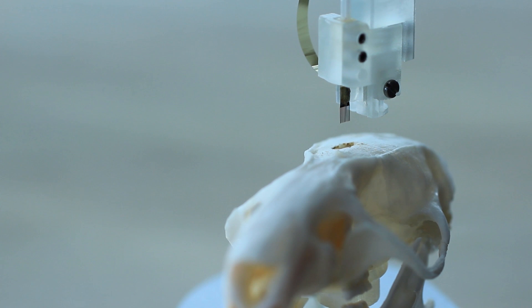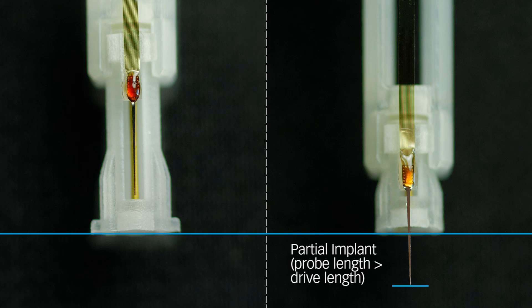Position the O-Drive at the implant location and lower until the base of the O-Drive is level with the bone surface. If your probe length is longer than the drive length, you will perform a partial implant, where the initial part of the implant is performed with the stereotaxic manipulator, and the O-Drive is used for depth adjustment afterward.